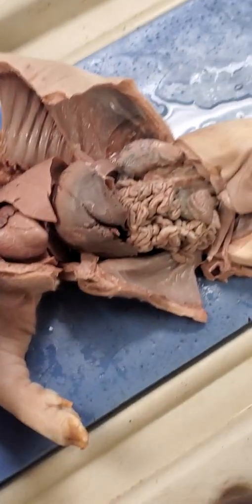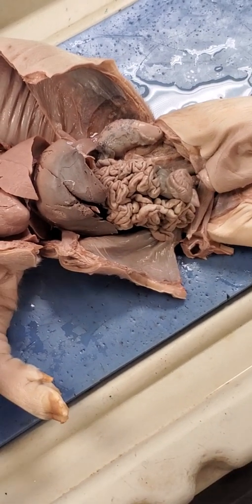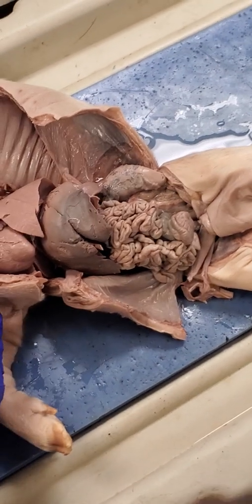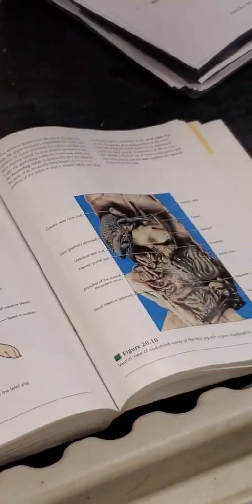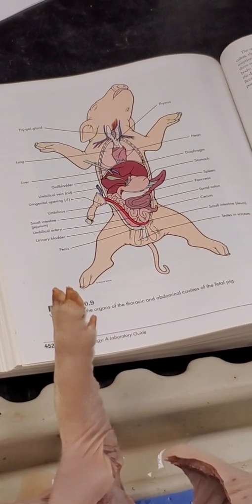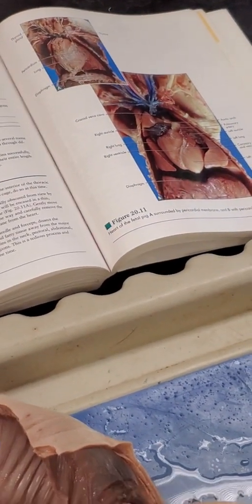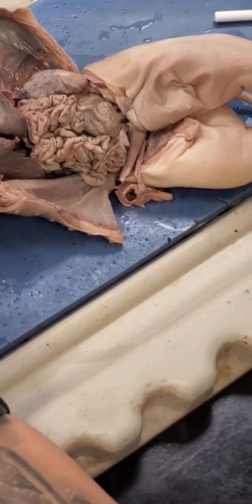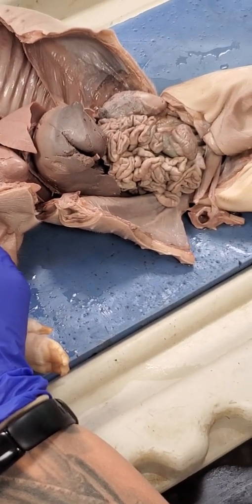So the kidney filters nitrogenous waste, and then our ureter brings filtered nitrogenous waste into the bladder. And I want to say that was a pain whenever we were looking for it. Will you flip one of these? Urogenital. One more time. Do you want me to look it up? Yeah, maybe. Do one more time. I just don't want to point it out without getting there. Sure, try one more time. Okay, here we go. Ureter.